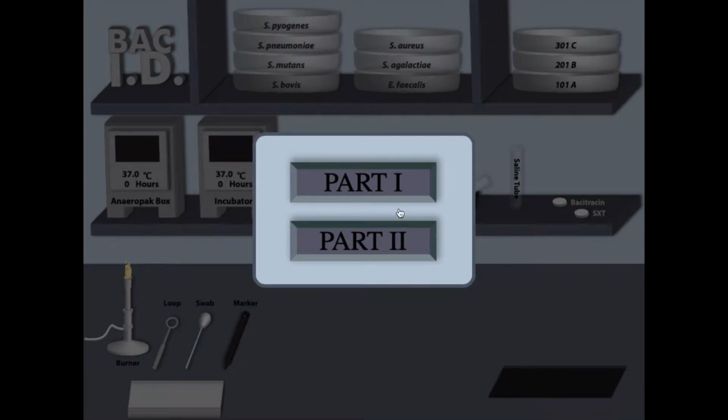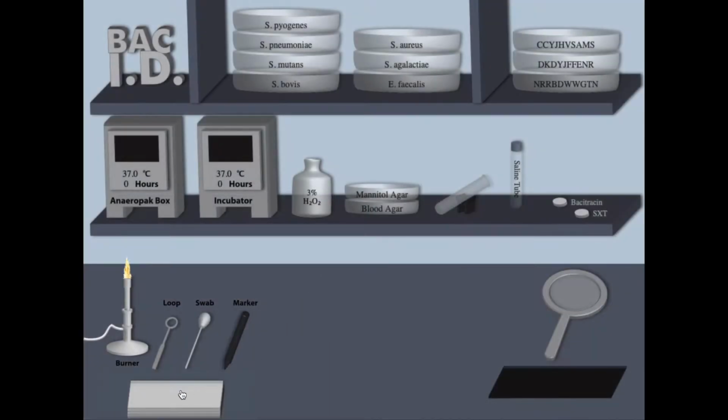Welcome to the Bac ID simulation. This simulation has two parts. In Part 1, you use the catalase test to identify samples as being Staphylococcus or Streptococcus. In Part 2, you'll conduct 5 different tests to complete your bacteria identification of specific species of Streptococcus. To begin, select Part 1.